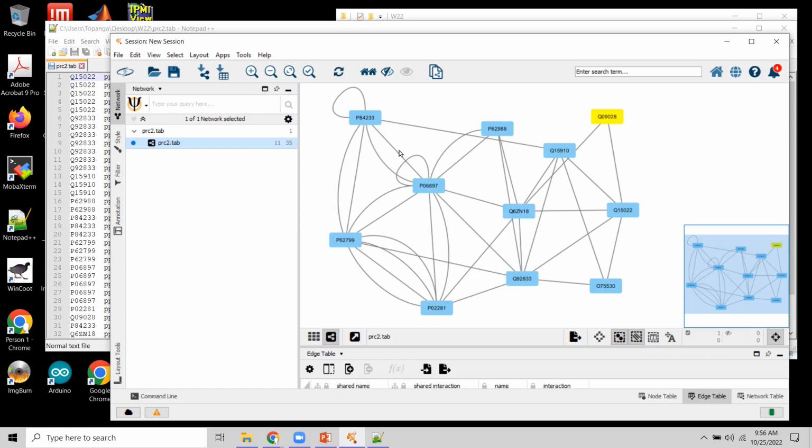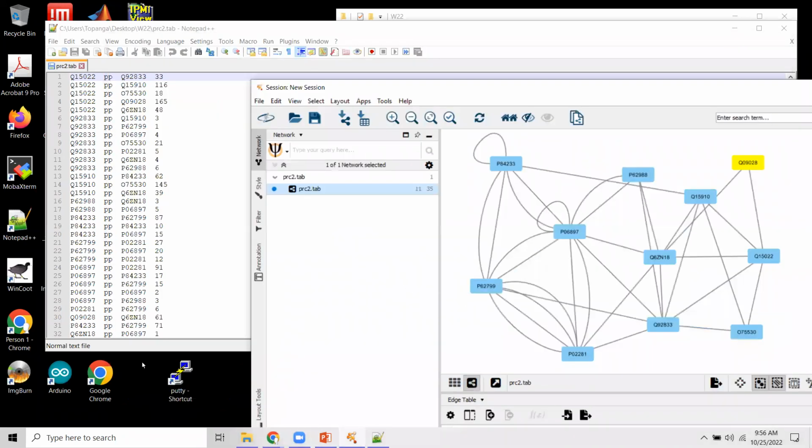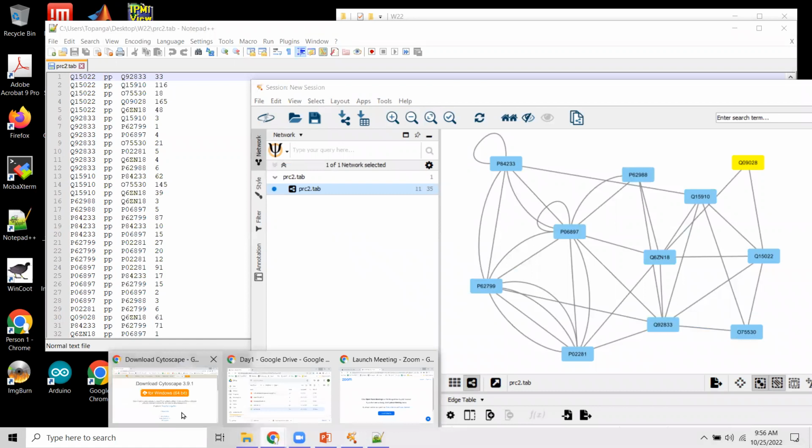This is pretty uninformative because no one knows, except for a few UniProt aficionados, what those stickers are. So it would be useful to attach some sort of informative data to at least our nodes. To do this, we've got to go to UniProt. Okay, so let's go there.